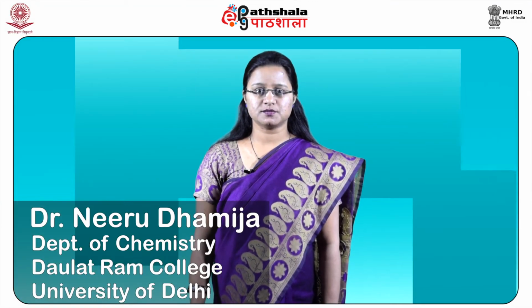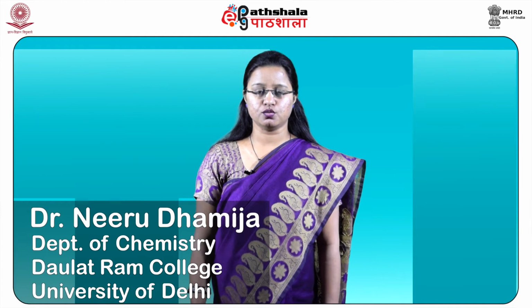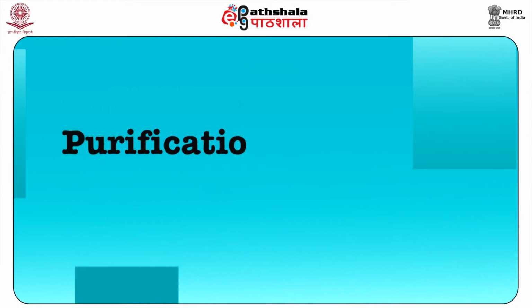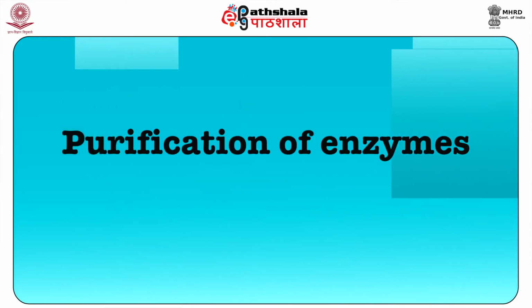After studying this module, you shall be able to know the various properties that enzymes possess, like differences in their size, charge and solubility. You are going to learn about how they are extracted from cells. You are going to know about various tools which are utilized to extract and purify these enzymes. Let's learn about the purification of enzymes.